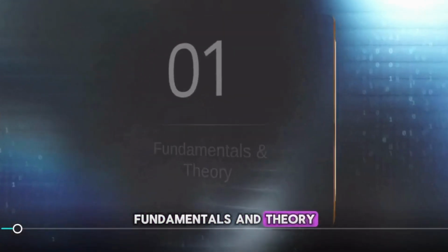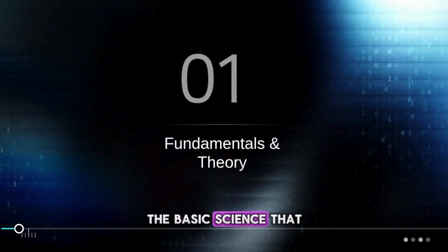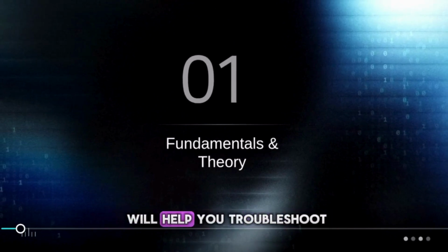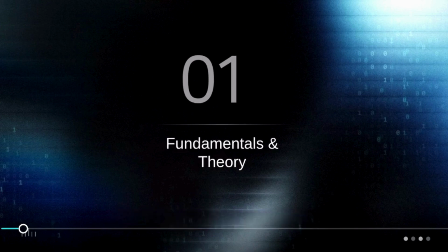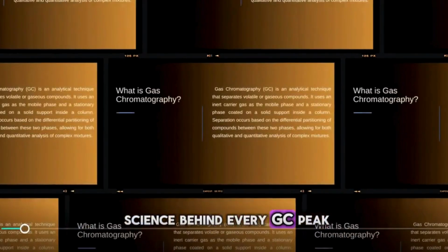Fundamentals and theory. Let's start with the foundation of gas chromatography, the basic science that makes everything else possible. Understanding these core principles will help you troubleshoot, interpret data, and master system design. Each concept leads toward confident real-world analysis. So, let's explore the science behind every GC peak.